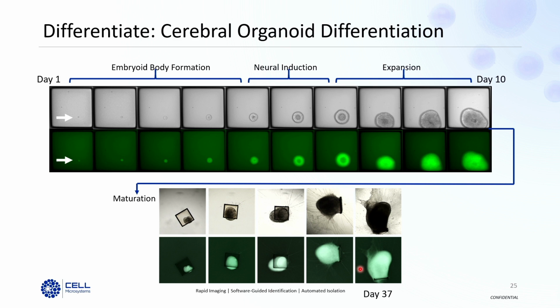Yeah, that's a great question. So the workflow for seeding organoid-forming cells on the array, we're using a methodology where the array is cool, so that we allow the ECM and the cells to settle into those microwells before polymerization. The array then goes into the incubator. That ECM polymerizes and sort of holds those organoids down into the microwell.